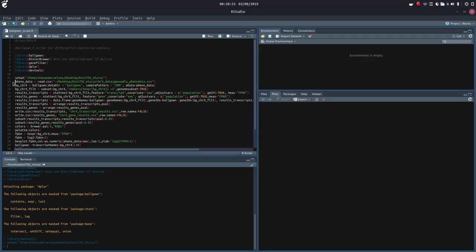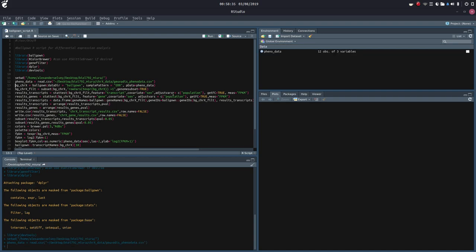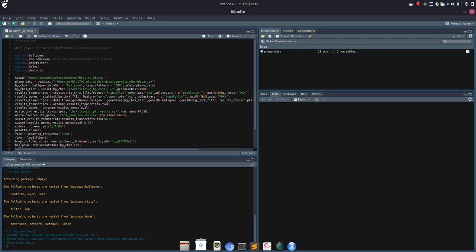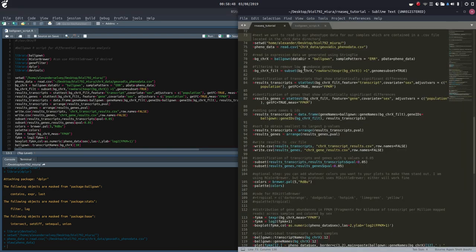Next, we're going to load up that phenodata using the read.csv command, and I'm going to give it the full path to the phenodata just to make it nice and simple. There we go — load it up, and as we can see, it's the same exact file that we were just looking at. I'm going to exit out of that so we don't clutter our workspace.